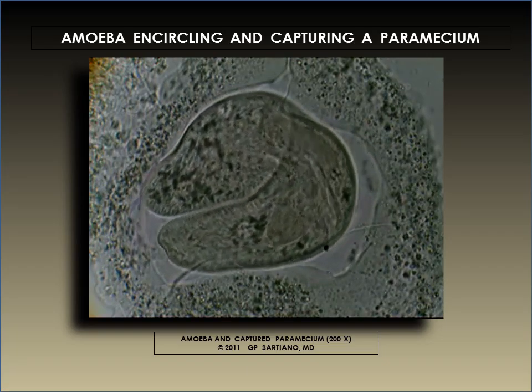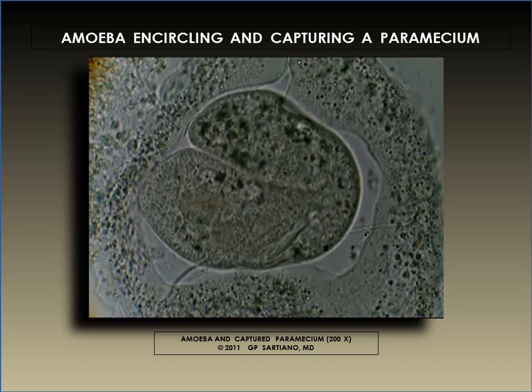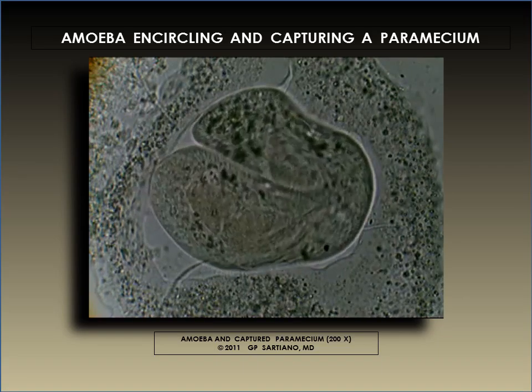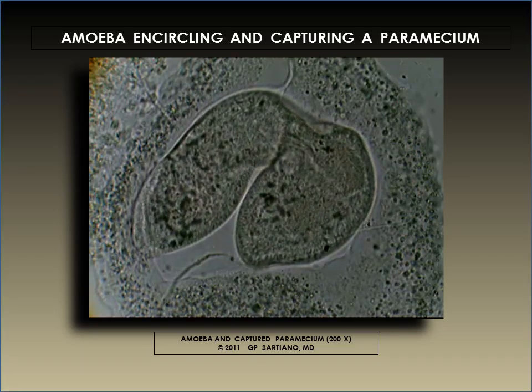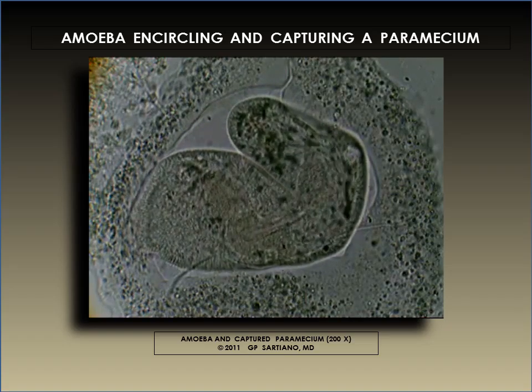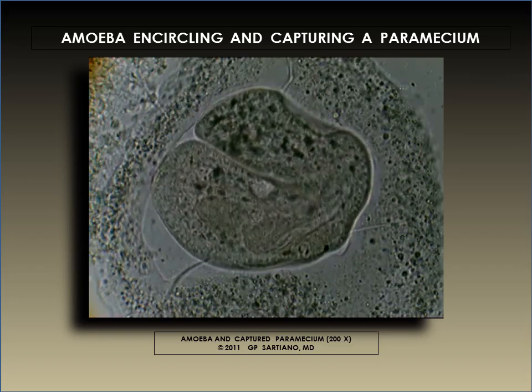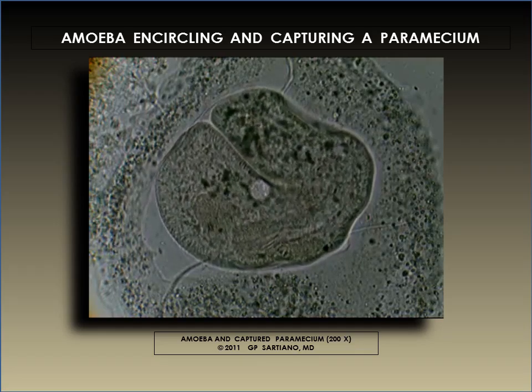Slowly but surely, the amoeba is extending its hyaline cytoplasm inward and taking up the space occupied by the paramecium. The internal structures of the paramecium, including its nucleus, contractile vacuoles, and cytopharyngeal cilia, are nonetheless intact and can still be seen in the churning cytoplasm of the paramecium as it continues to struggle within a limited volume.